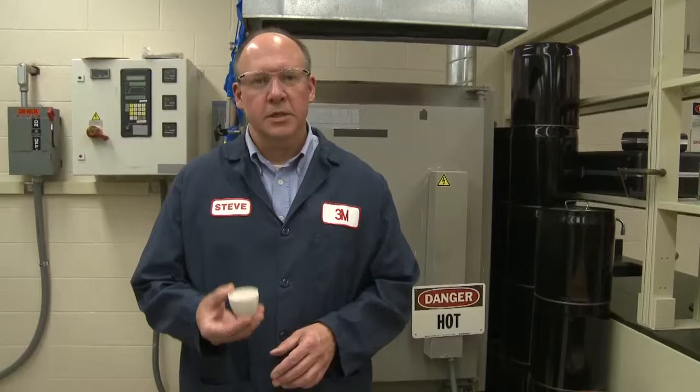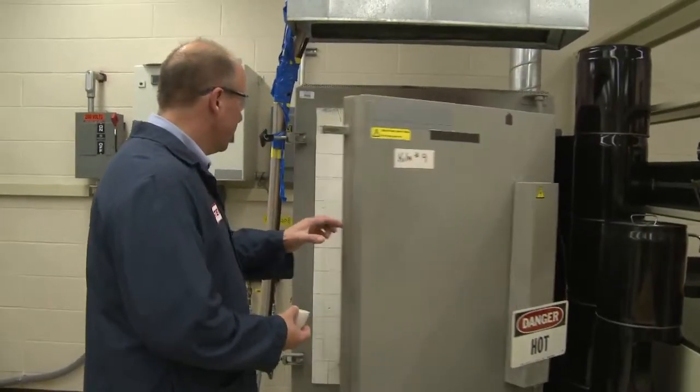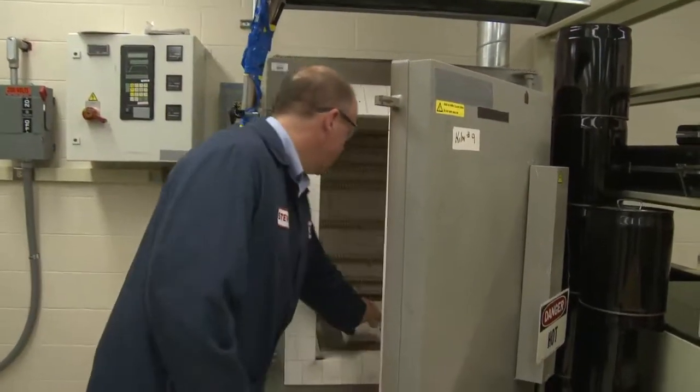We take the plastic pellets, or injection molded material, we stick it in a crucible, we put it in a kiln, so that overnight we can heat this kiln up to 600 degrees C.